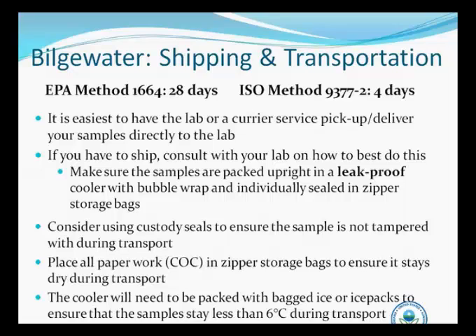The other consideration is that the samples, when shipped overnight, have to be in a leak-proof cooler. So all your samples need to be in Ziploc bags, bubble wrapped, and all the ice should also be in Ziploc bags, and nothing should be leaking. Definitely consider using custody seals to ensure that the samples aren't tampered with during transport. And keep in mind that the chain of custody forms do need to follow the samples, so a good idea is to put that in the Ziploc bag as well to keep it from getting wet.